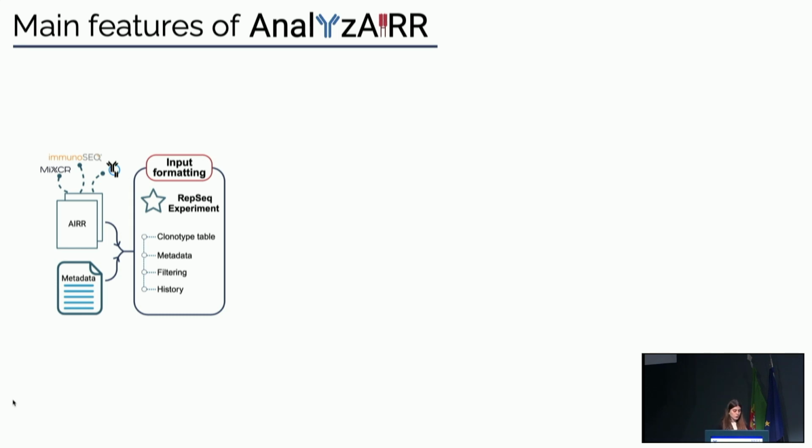The user can also supply the package with a metadata file that contains any information that the user will judge necessary for their analysis. AnalyzAIRR will take both of this information and integrate them into a RepSeq experiment that contains the clonotype tables, the metadata, and other information that I will go further into detail in the demo.